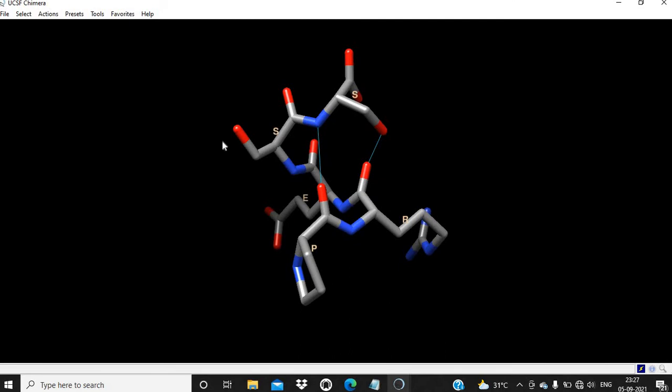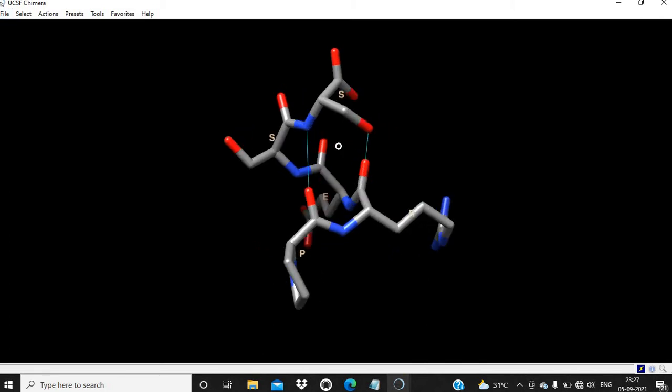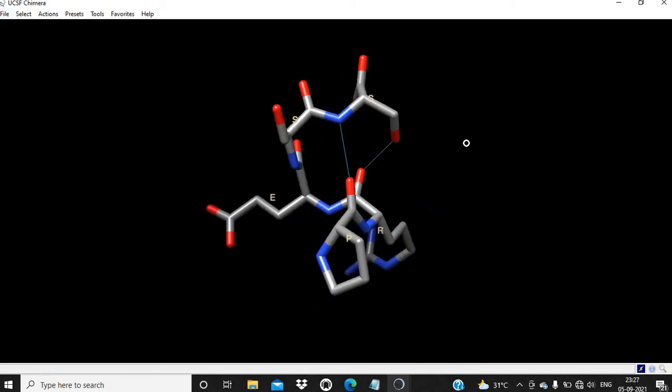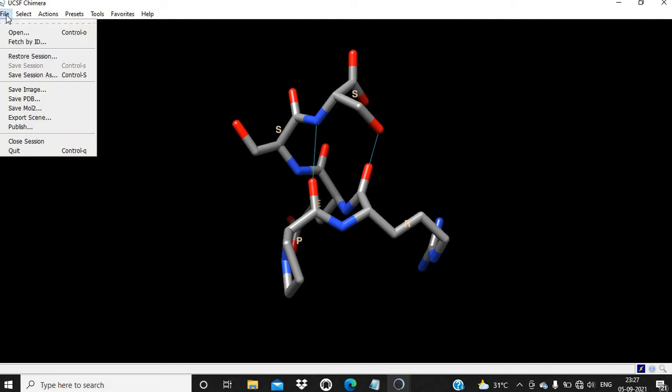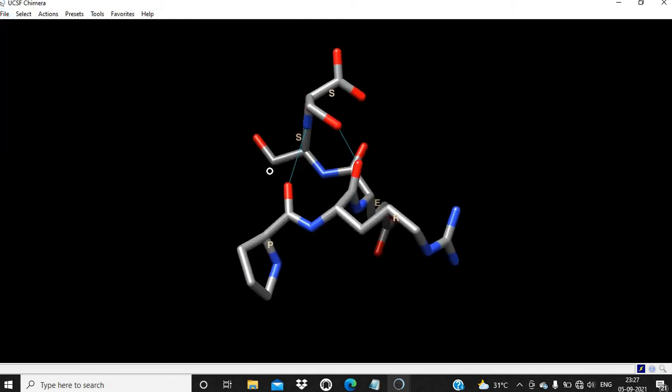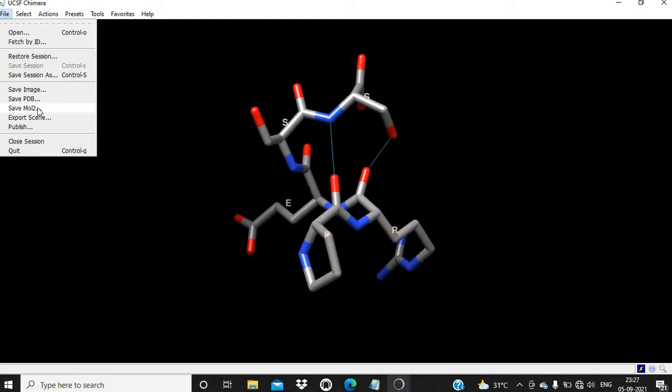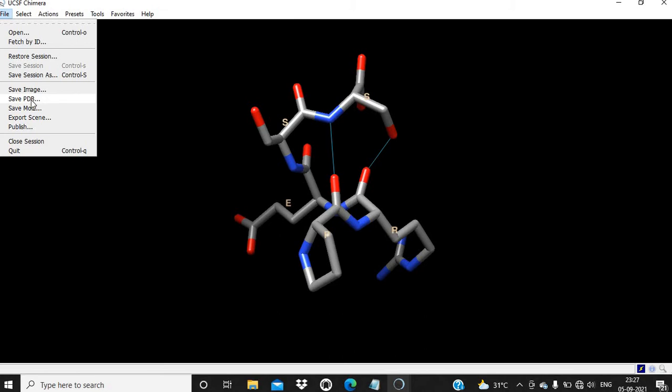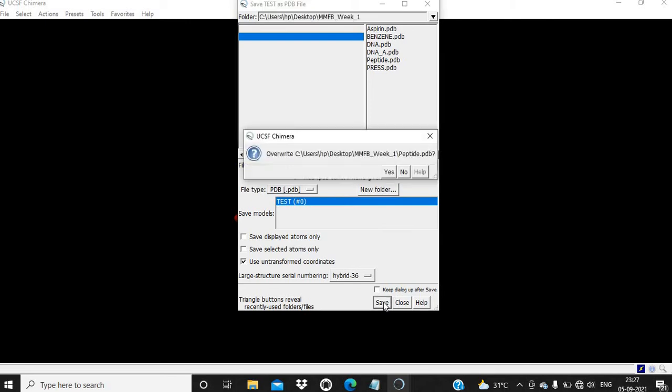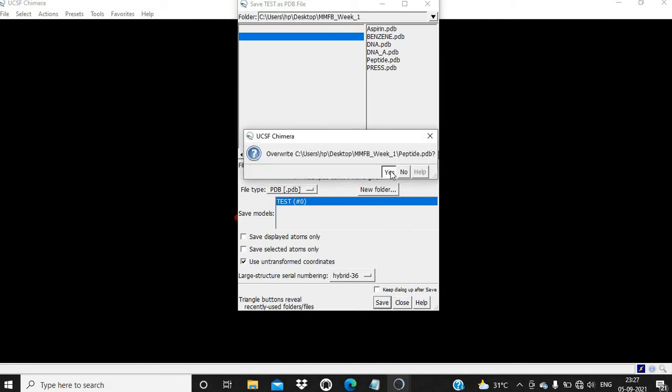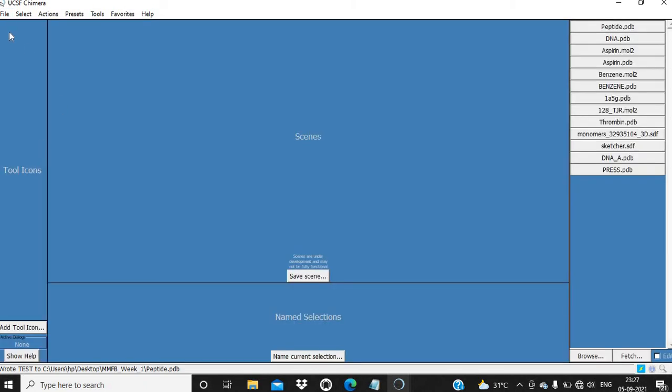In this way, you can build a peptide structure and analyze the structure. You can use this peptide structure for further analysis or molecular modeling work. To save this peptide structure, click on Save PDB, then peptide, and then save. This structure has been saved.